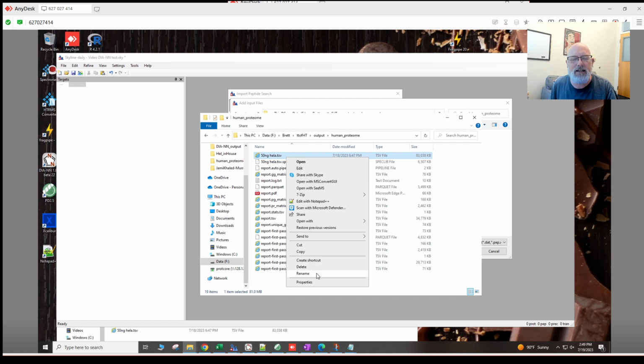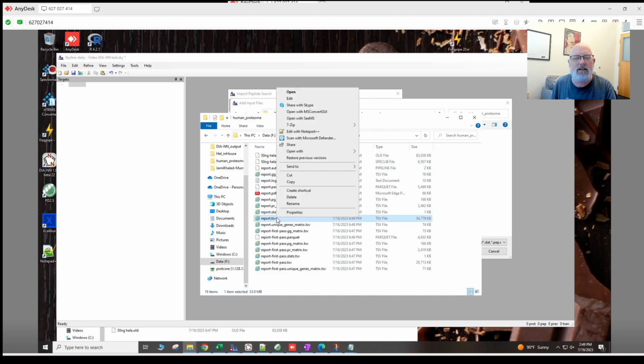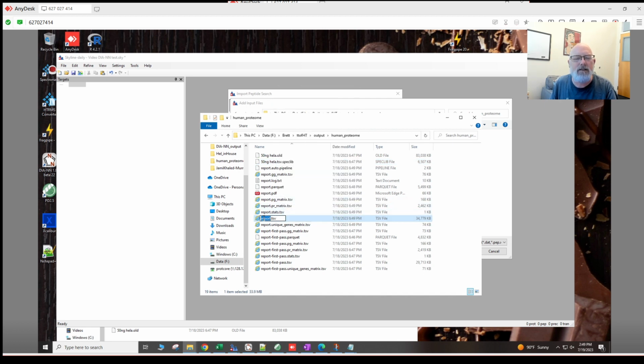We're going to rename as old, and I used the wrong directory. That's why. So now we're working in the right directory, old. Yes, and we'll take the biggest file, this one, rename. Okay, and then we're going to rename this, and we'll put that at the beginning, underscore.